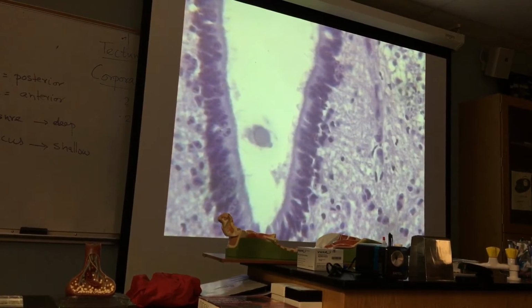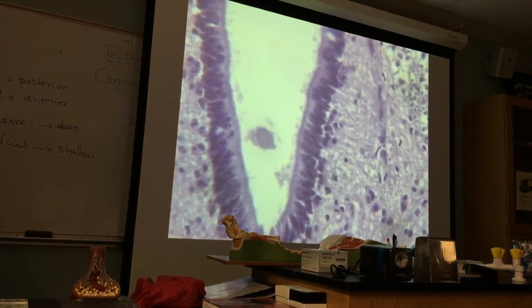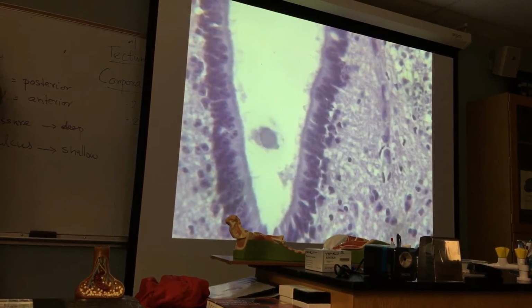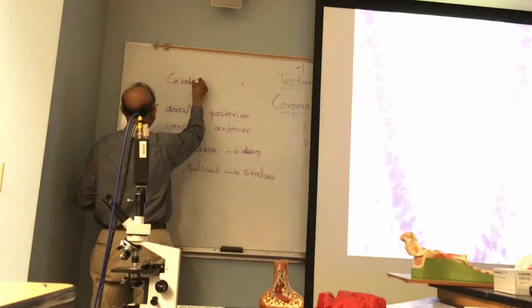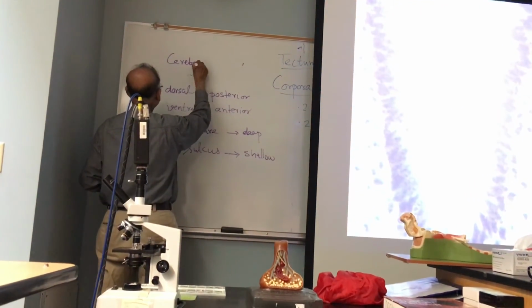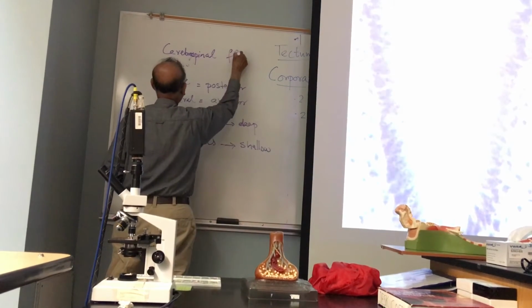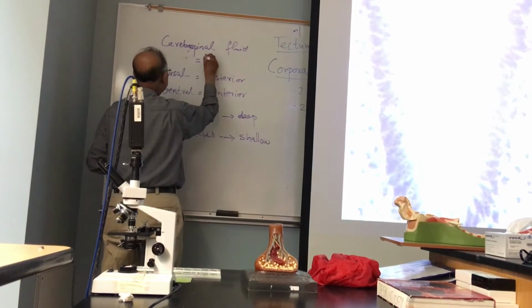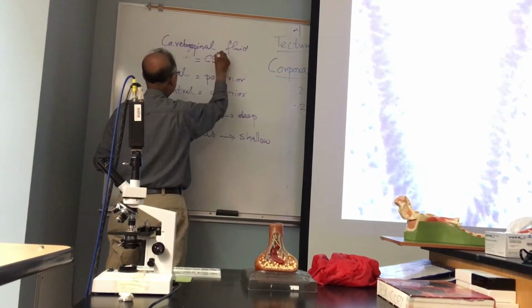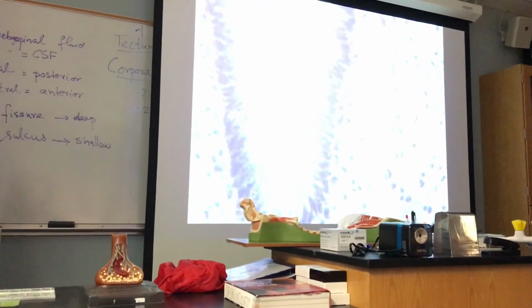CSF, or cerebrospinal fluid. Cerebrospinal, one word, spinal fluid, but when abbreviated, it is CSF. Okay?